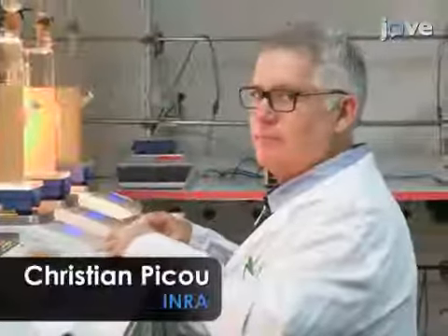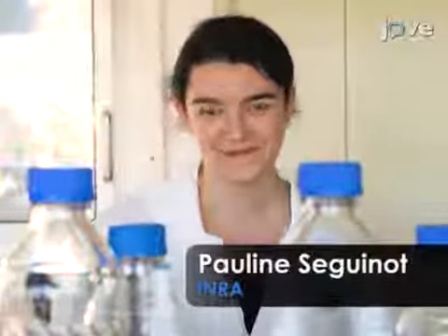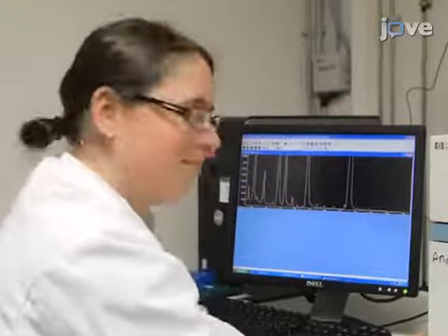and microorganisms. The key to success with this experiment lies in the reproducibility of fermentations. Users must pay particular attention to collect the cells in the same defined physiological stage. Demonstrating the procedure will be Picou from our technical staff, Pauline Seguinot, a PhD student from the laboratory, and Rollero, a postdoctoral fellow.